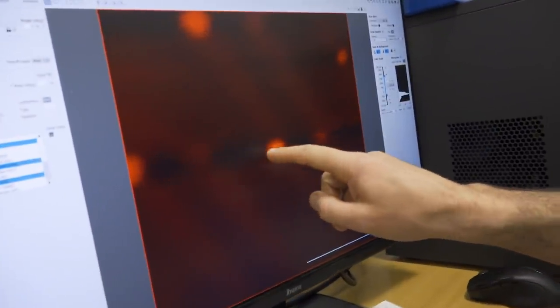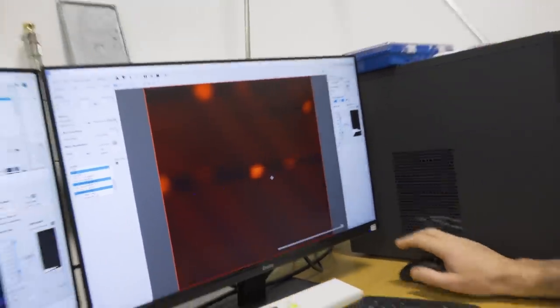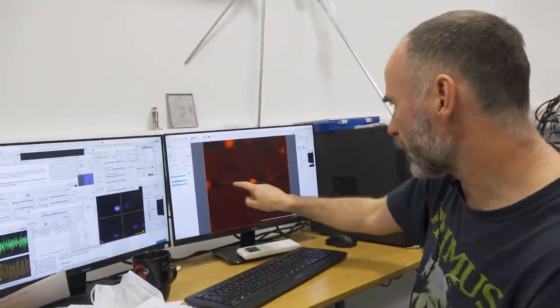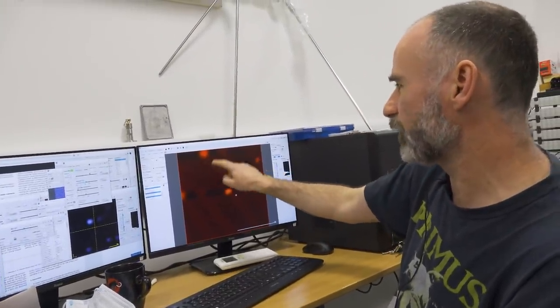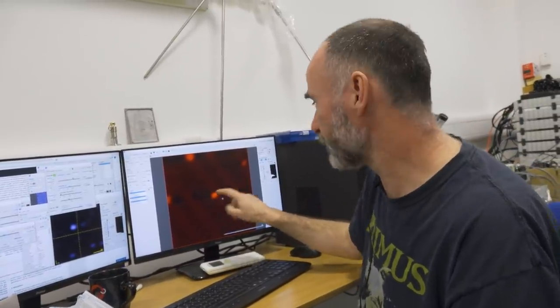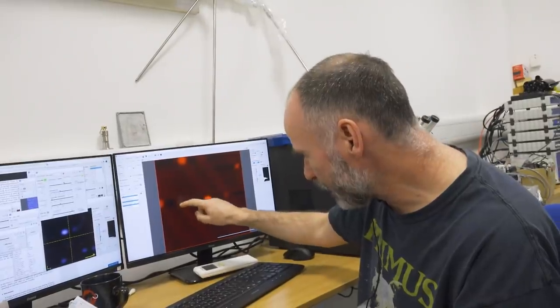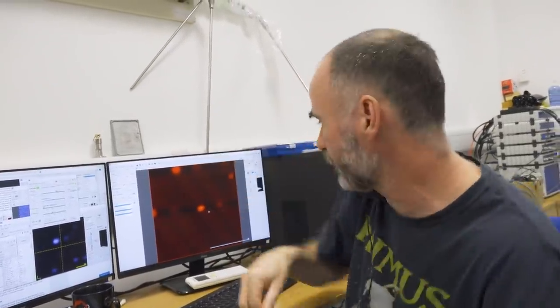So you see these sharp changes? See this chart where it looks like the atom's been sliced? That's because it's interacting with the tip. These other shadowy features, you see each one's got a tiny little ghost image. You get used to seeing these things. Sometimes it's difficult to spot them, but this very faint ghost is probably because we've got a slight double on our tip.